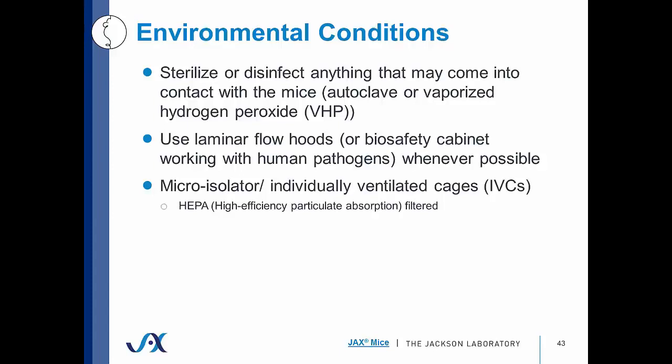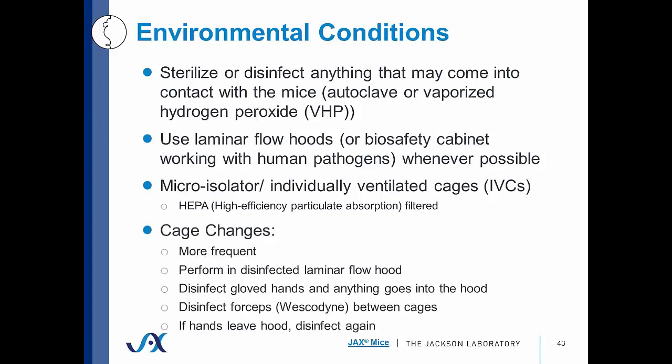We also recommend using a micro-isolator or individually ventilated cages that are equipped with a HEPA filter. And the cage changes are more frequent just to reduce that pathogenic load. We also, as I mentioned, perform them in a disinfected laminar flow hood. You disinfect gloved hands or anything that goes into the hood. Also, when changing cages, use forceps and disinfect those forceps between cages. And finally, as I mentioned, if your hands leave the hood, disinfect your hands again. And so for that reason, we try to keep everything within that hood.